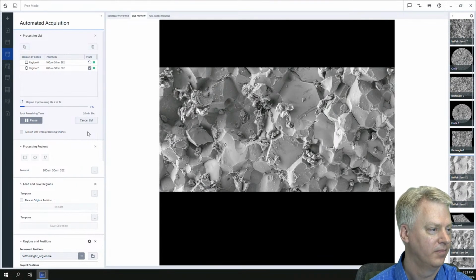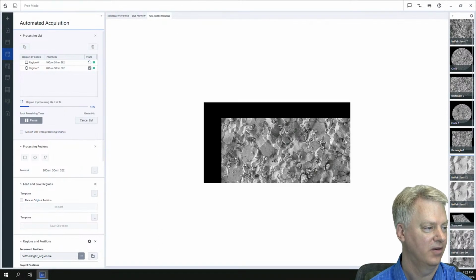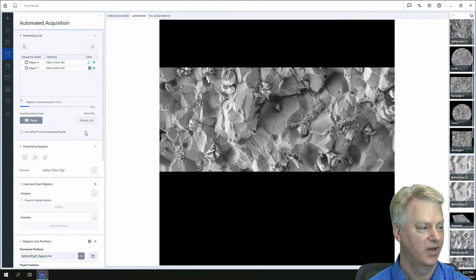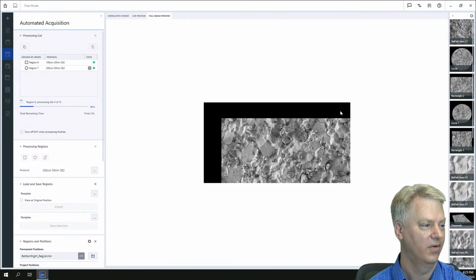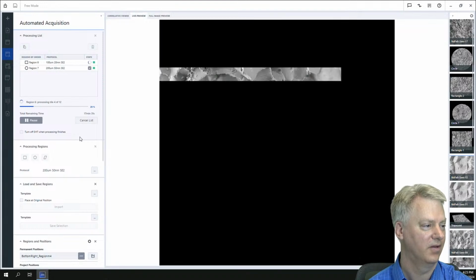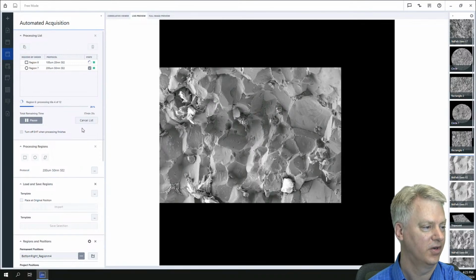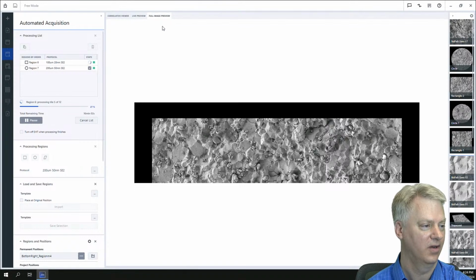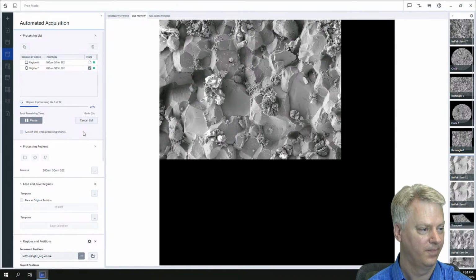It has a live preview, which is what we're seeing now, but as it's dumping these in, it'll add another tile and another tile until it completes the mosaic. So what it's doing is individual images here. If I move over to here, then it's going to dump that there. If we go back to the image, then it keeps doing the imaging. And as it's imaging, we could go on to here, and we could zoom in and out if we wanted to and take a look while it's acquiring. It doesn't care. As long as the image information is there, we can take a look at it.